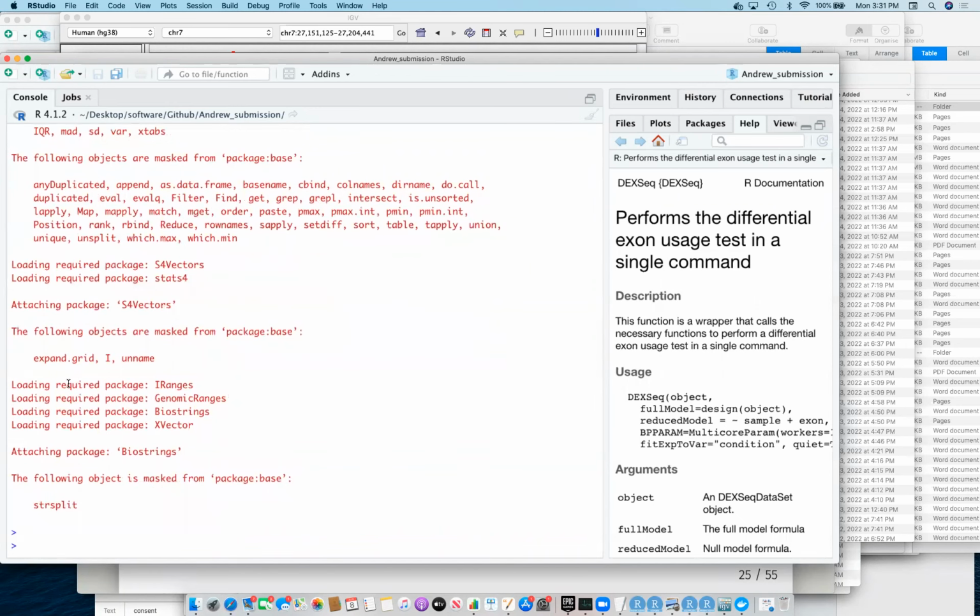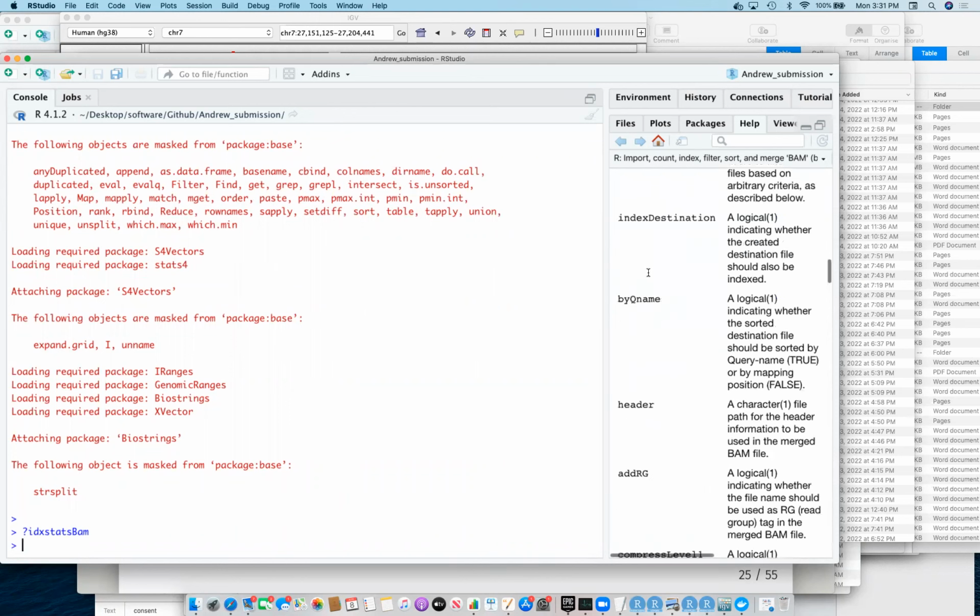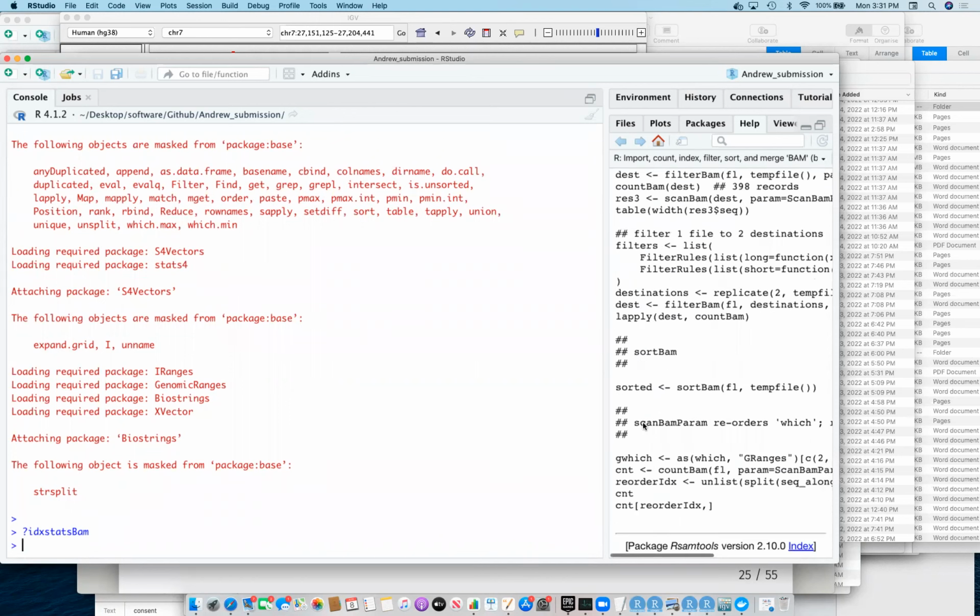If you ever get that, where R suddenly breaks like that, you've either hit a memory issue or it's because something you're using doesn't necessarily error well. It's usually C++, so it's passed it down to C++ and some memory is going around. No big consequence, just restart the session again, I guess.